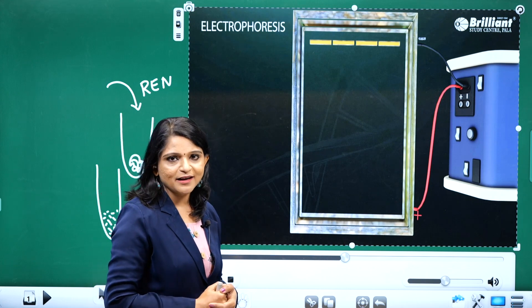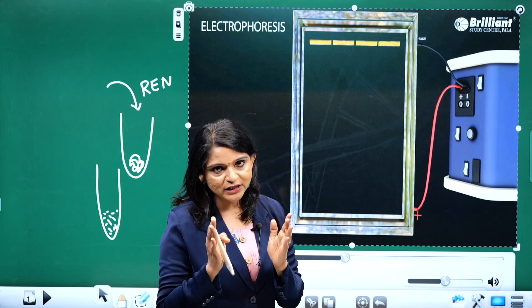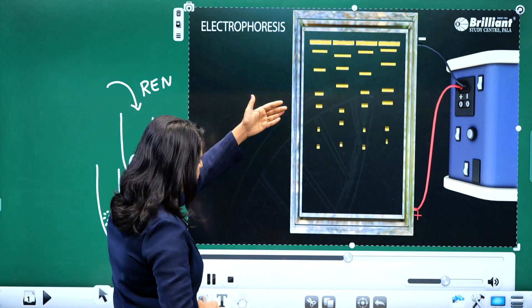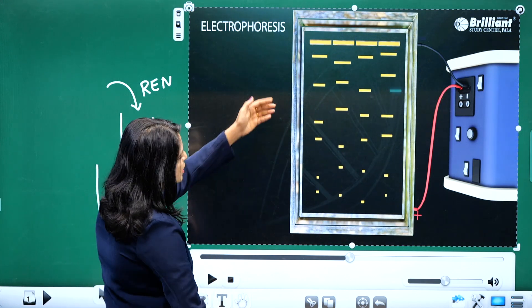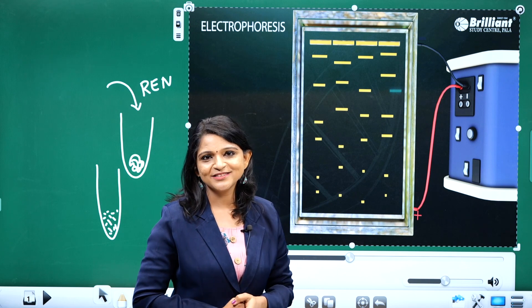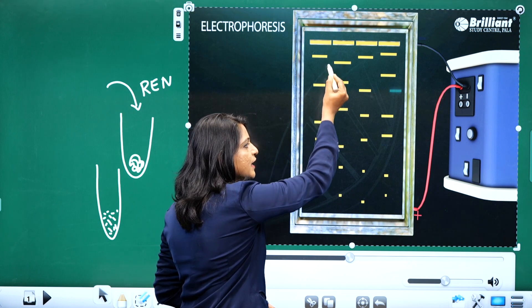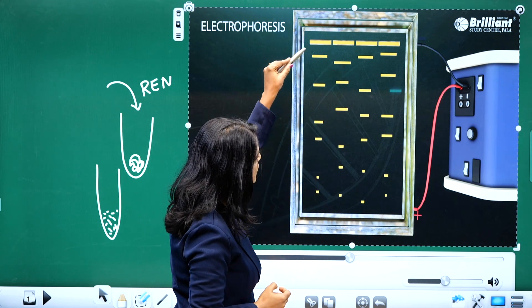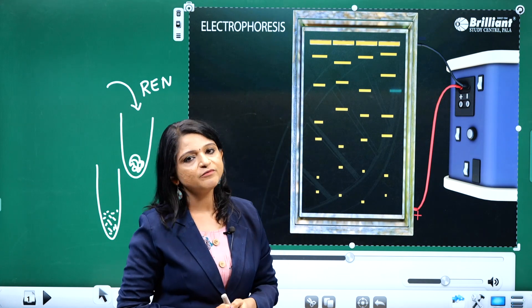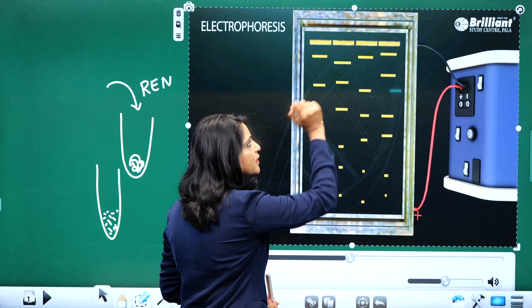After loading the DNA, I'm going to switch on the electric current. When we switch on the electric current, DNA starts to migrate from the negative electrode to the positive electrode — because DNA carries a negative charge. When electric current is applied, the negatively charged DNA moves from the negative wells toward the positive electrode, and this migration depends on the size of the DNA fragments.